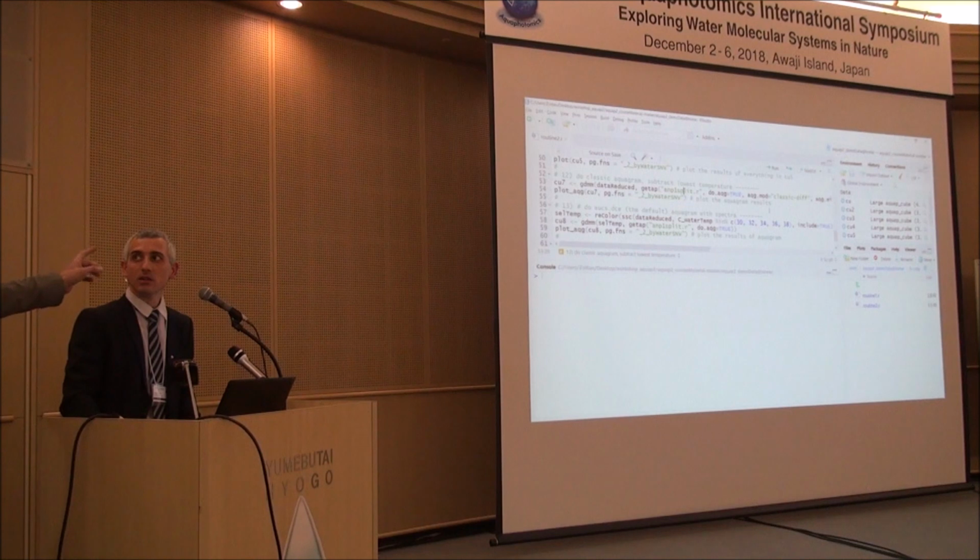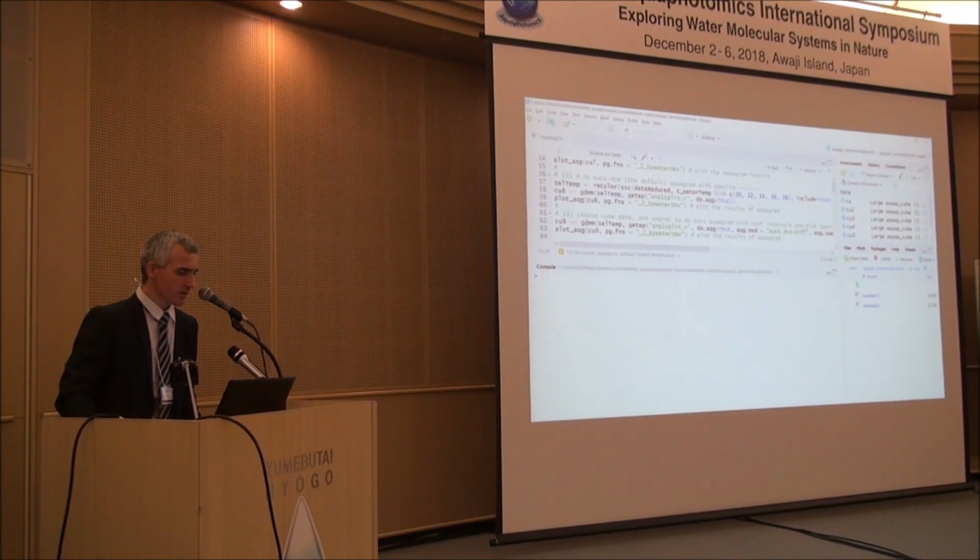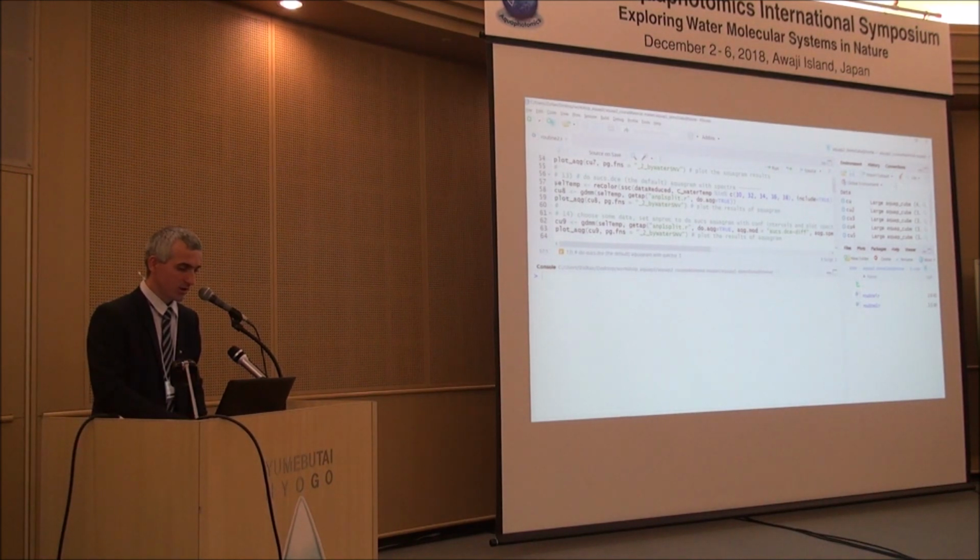Maybe we should go to 13. We skip the classic diff. Okay. Go to the linear and that's it. Again, in this case, we will reduce our data set to emphasize the benefits of the new aquagram calculation method, because in this case we will calculate standard deviations and confidence intervals as well for the aquagrams.